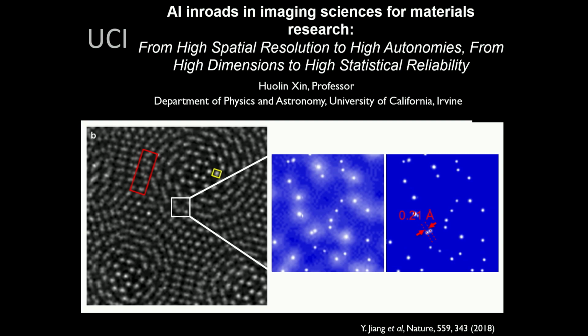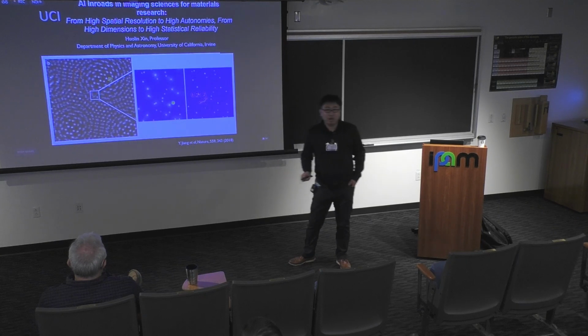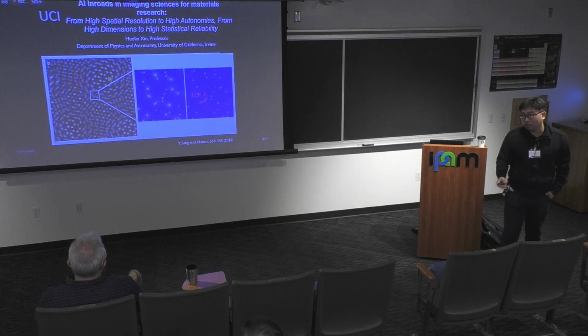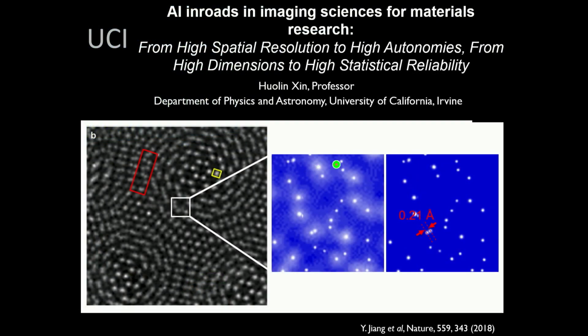But of course, for the experts here, for a blob of intensity that wasn't resolved, you can actually fit an infinite number of point spread functions to it and still get a good fit, right? So take it with a grain of salt. However, with those images, you typically know they are atomic structures, and you have a lot of prior knowledge you can use. And also you have knowledge about the point spread function. For example, you take one of those, and you can actually arrive at this as the most likely solution.